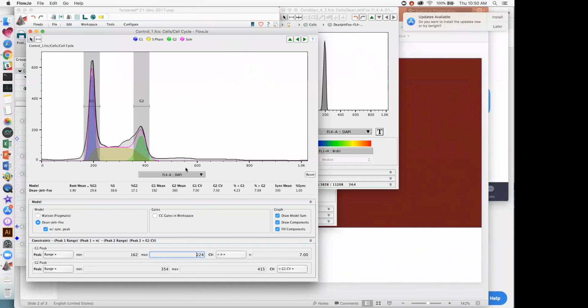Okay. To Ling Zhang, who asks, that means use the minimum RMS is better? Yes, go ahead and use the minimum RMS. That's a safe bet to go with.